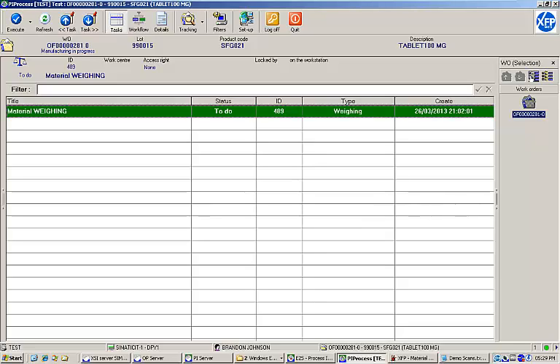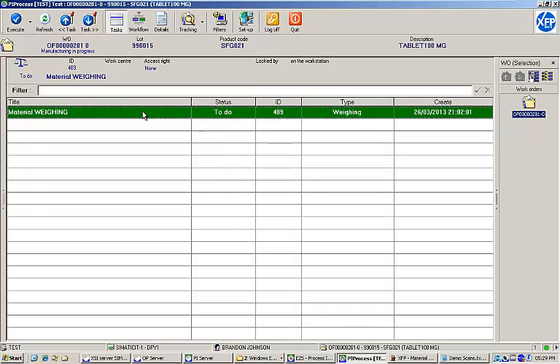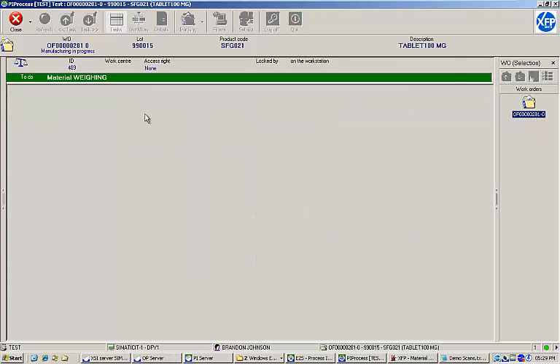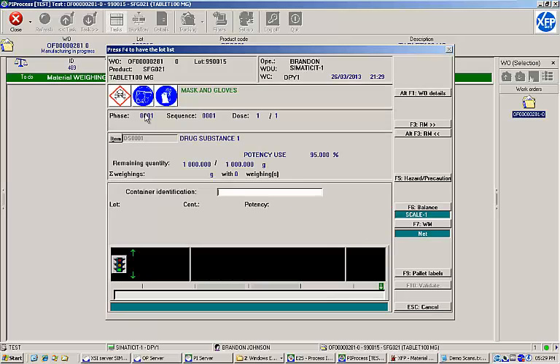Here we can see a task named Material Weighing in the EBR execution task list. I'll double-click on the task to launch it. Since this is a weighing task, XFP launches the weighing screen instead of standard process instructions.